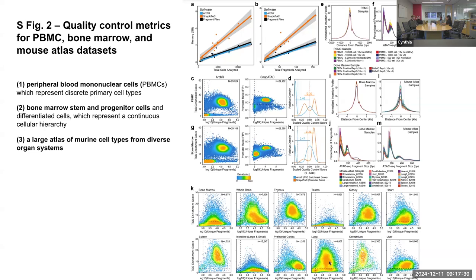So to me this means that this recommendation should be taken carefully, because it looks like it is very dependent on the kind of tissue. This at the end is the data that they include for further analysis.